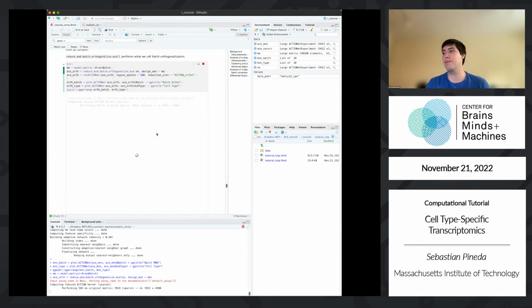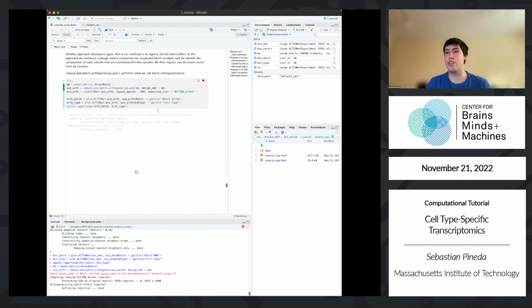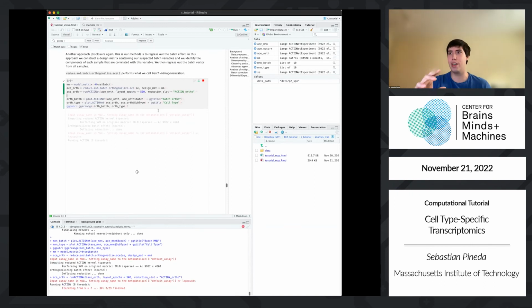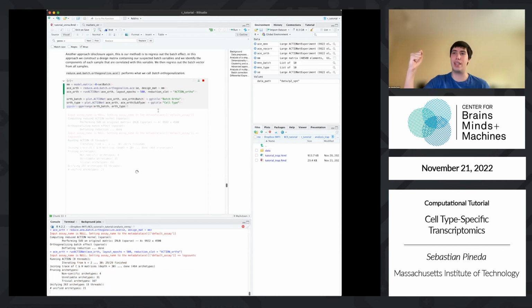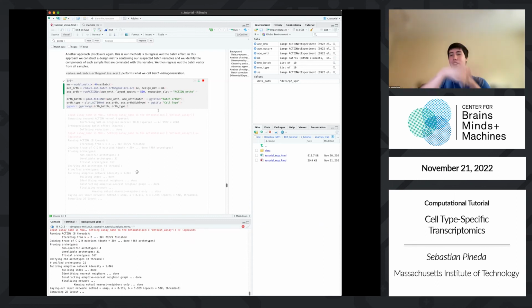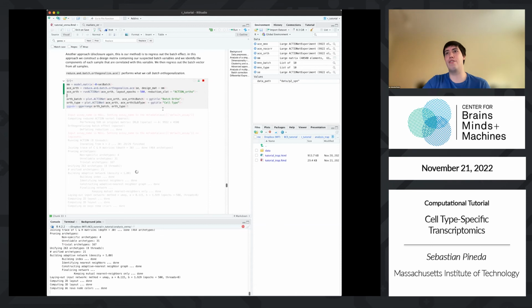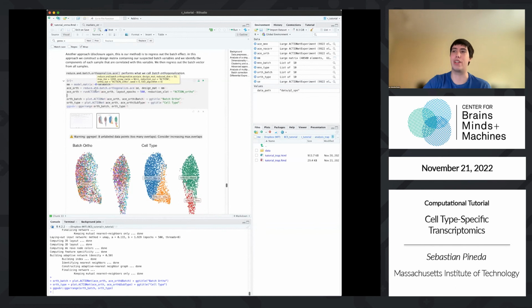We're going to run that real quick, and compare how it works to the brute force panoramic stitching method. What this does is it runs our decomposition where we remove all the uninformative genes. Then it asks, what does this one sample have that is different from every single other sample? It does that for every sample, and removes that from every other sample. So it forces all the clusters together by removing the batch-specific variation. And this is what we get.